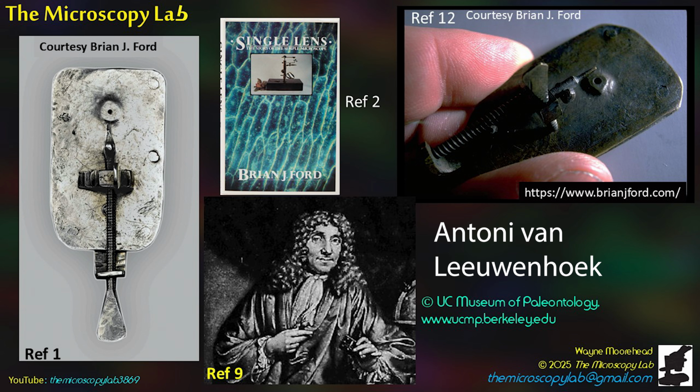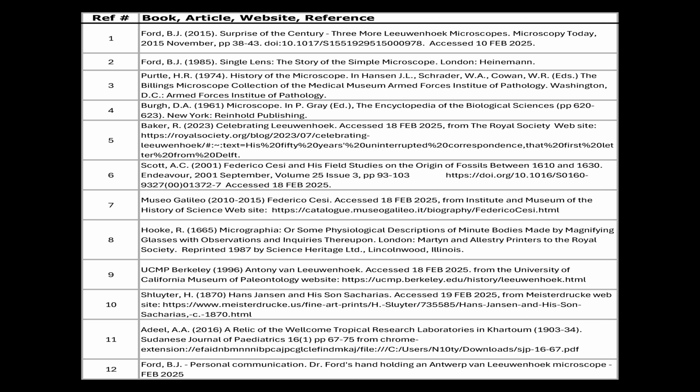Over the centuries, many improvements to the microscope stand, optics, and understanding of light with its interaction with matter were developed. In particular, in the mid to late 1800s to early 1900s, great leaps transpired in understanding of lenses, aberrations in lenses, their corrections, as well as understanding of light.